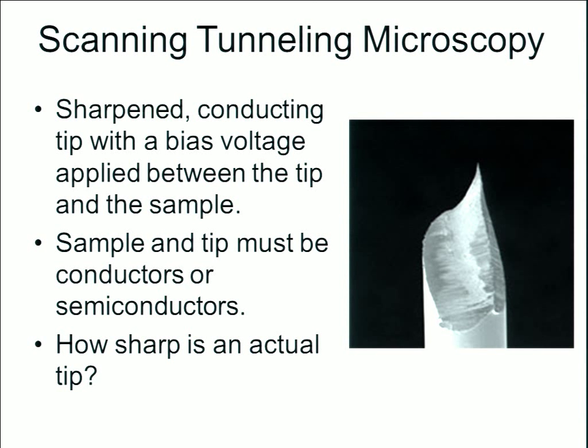As far as the tips, here is actually a scanning electron microscope image of one of these tips that was fabricated with that cut and pull technique. The sample and the tip, as we said, must be conductors or semiconductors, and the question might be, how sharp is an actual tip? Well, again, it depends on the technique employed, but hopefully these are in the low tens of nanometers or less.